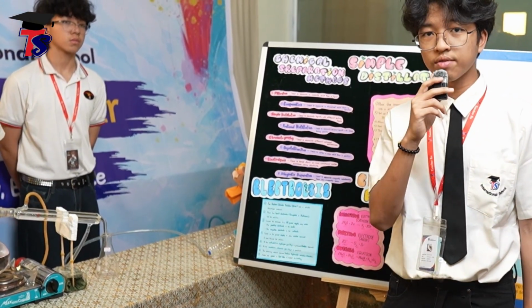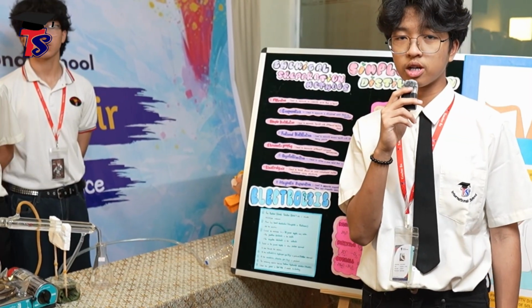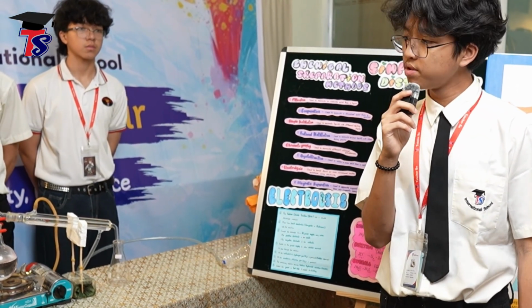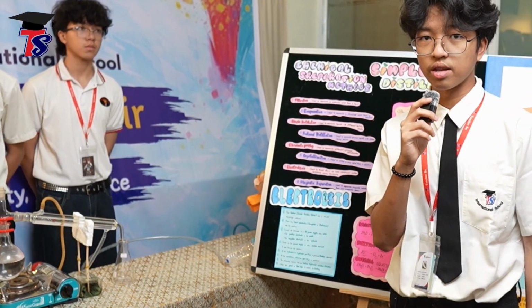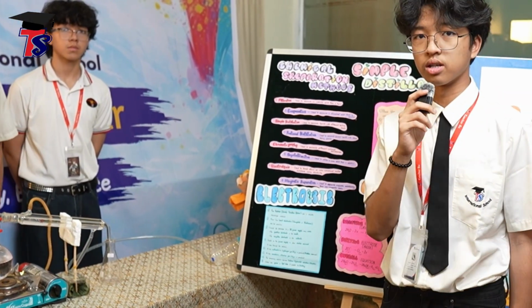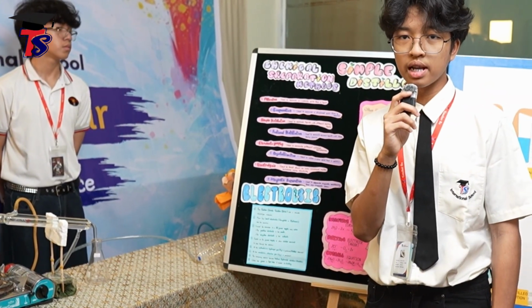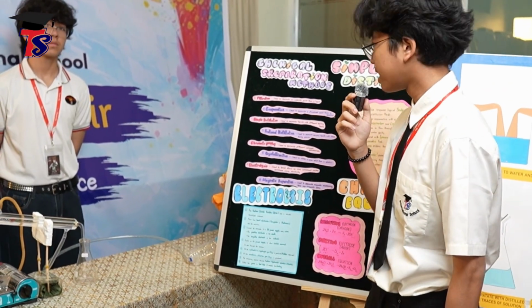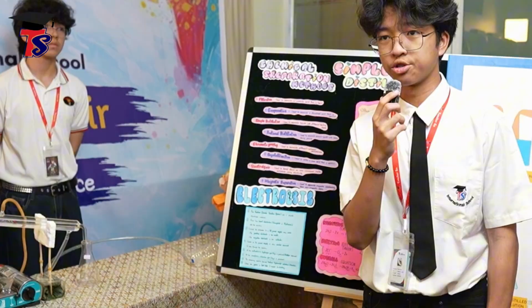And lastly, after the experiment, the remaining solution will become sodium hydroxide, which is an alkaline solution. If we were to test the gases mentioned in the electrolysis, we will collect them in test tubes. Now, I'll be handing over to Ellie to explain about distillation.